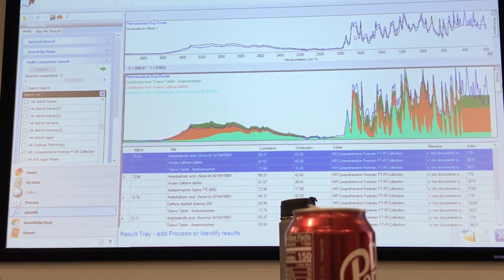The other thing, if you look at it, is that it will give ballpark figures for the composites. This is not true concentrations, but it's almost within 10%. With most of the analysis that I have seen so far, it's quite semi-quantitative, so you can say, yes, PVC is almost like 80%, and maybe there's 20% of polyethylene or PET or something added into it. So that's what the composite up there tells you, and that is just based on how much absorbance each of the spectra is contributing. That's how you get that data out.